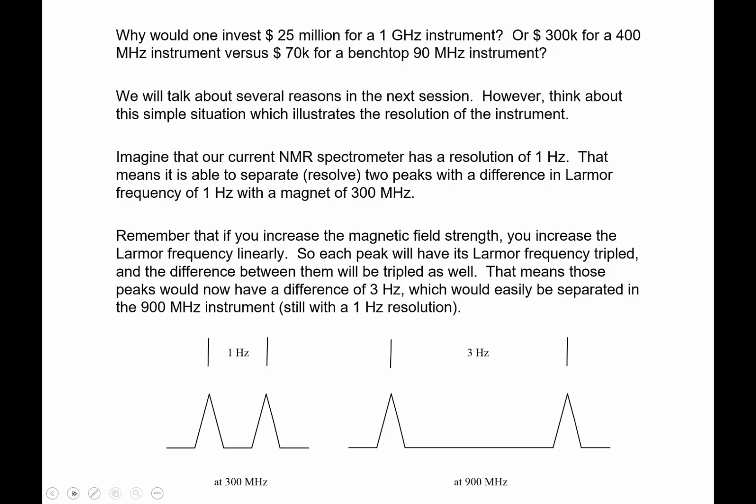Now, bio-NMR doesn't necessarily show up in the biology or genetics books, but people can determine structures. Remember from last week, if you can't get a single crystal of a biomolecule, you can't get a crystal structure. If it's small enough, you can do NMR and determine if it's folded, if it's not folded, if it's alpha helix, if it's not alpha helix. You can find all of them. So there is a need for these high field instruments, and that's the reason.